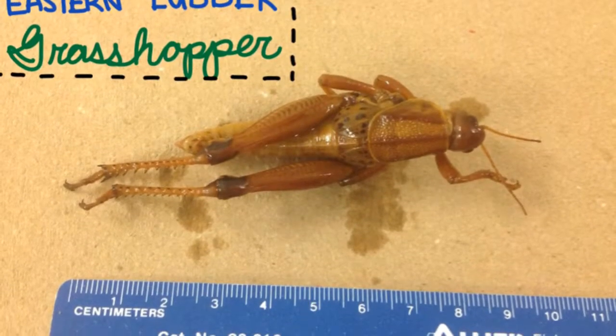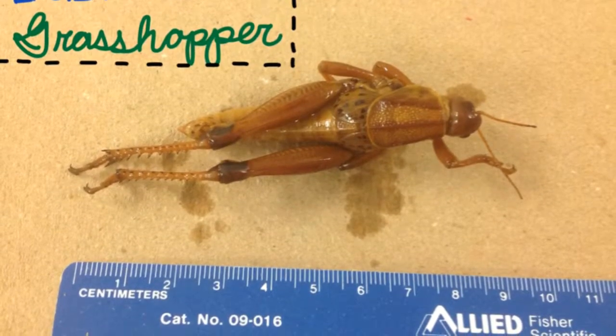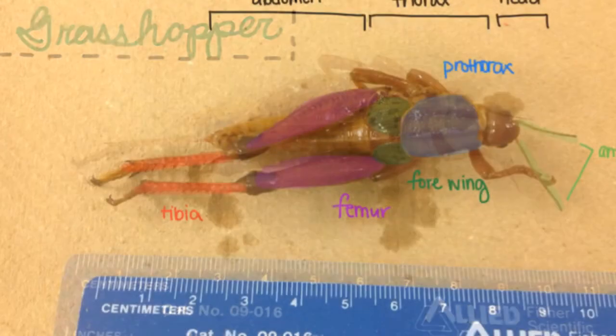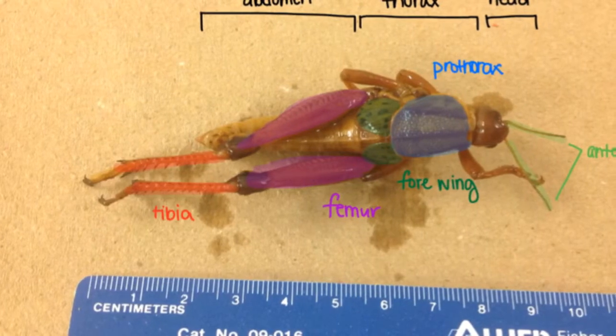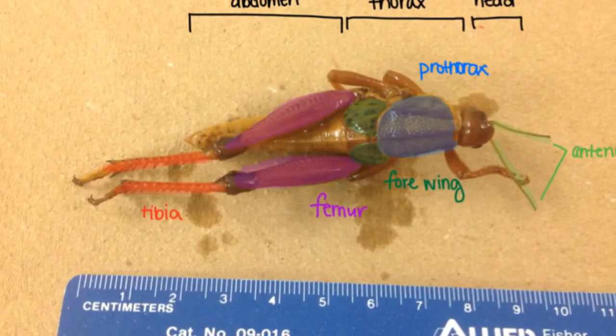Ken Paiseki here once again for our next dissection. This one's going to be the Eastern Lubber Grasshopper. This is a real interesting one. Before we do the dissection, I want you to know that it can be broken down into three important parts: we have the abdomen, the thorax, and the head.